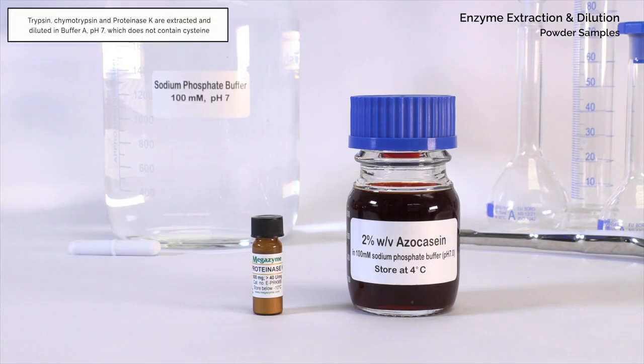Trypsin, chymotrypsin, and proteinase K are extracted and diluted in buffer A, pH 7, which does not contain cysteine.